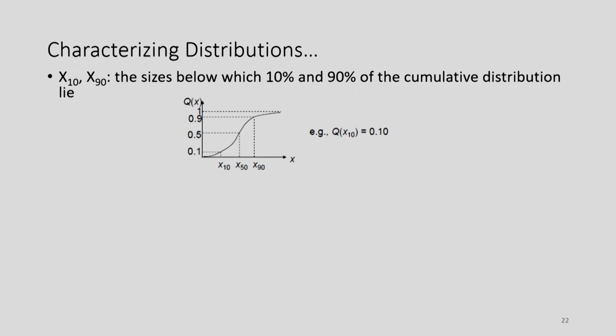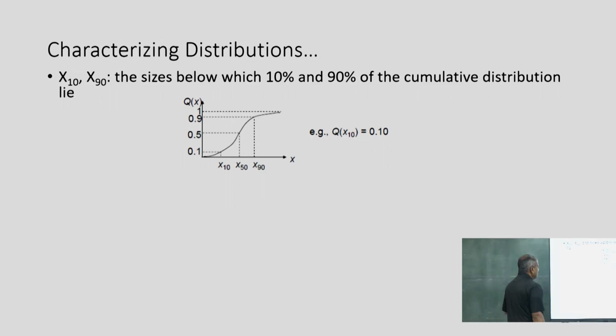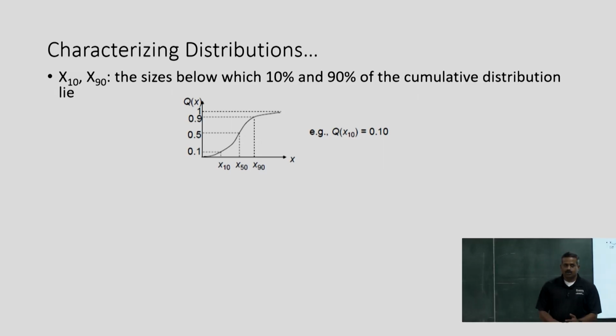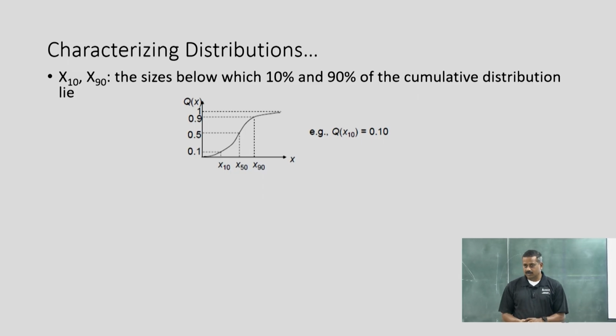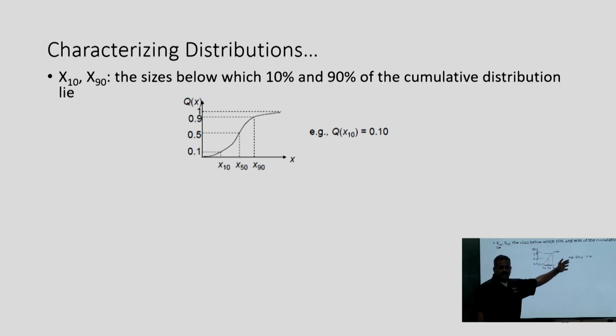Then again from cumulative, as I talked before, you can get D10, D90, D50, etc. So 10% of particles that are undersized, or 50% of particles that are undersized, etc. So, either coarser or finer. This is a finer distribution. If you're plotting a coarser distribution, then you can get 10% of particles coarser than that value, etc. So, it's clear now, right?